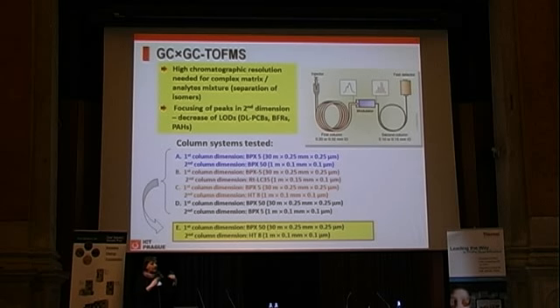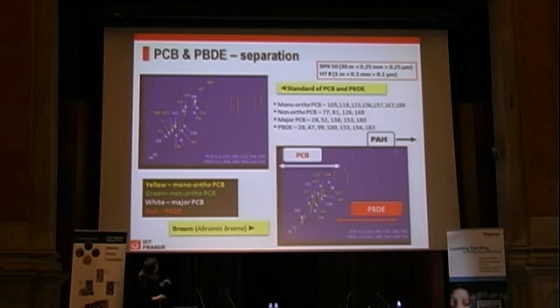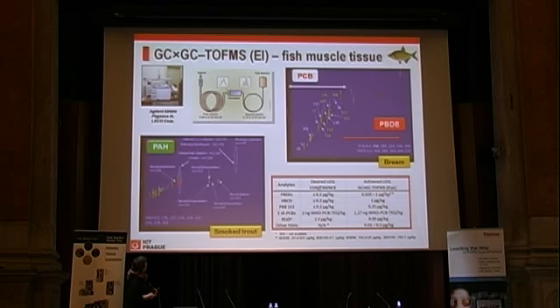Unfortunately, with a lot of positive spots, which are the analytes, impurity analytes in there. And also with PAHs, this is even more critical because, as you know, in electron impact, PAHs don't have too much fragmentation, and what you have to do is to have good chromatographic resolution. So, for example, for smoked trout, we had to do a lot of combinations to improve separation, like I will show here. We played with a lot of columns and critical groups. I don't say pairs, but critical groups. And at the end, we managed to find a solution for them.